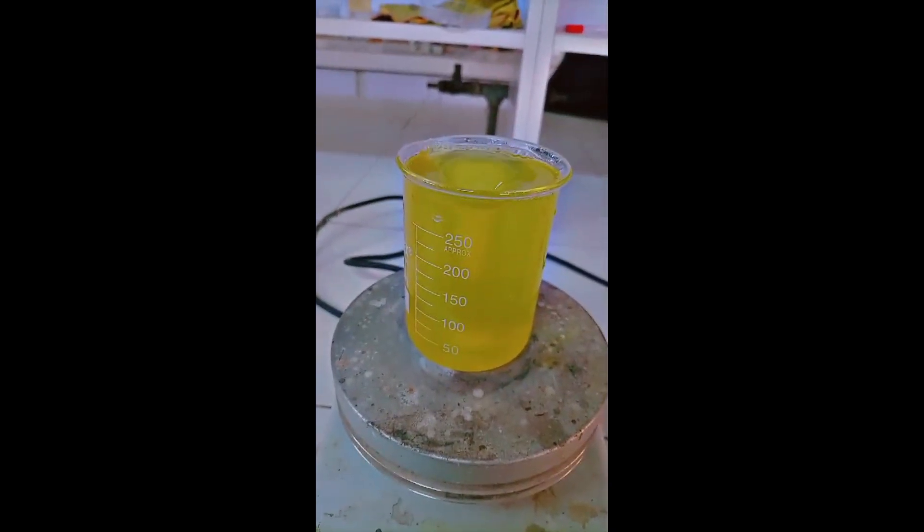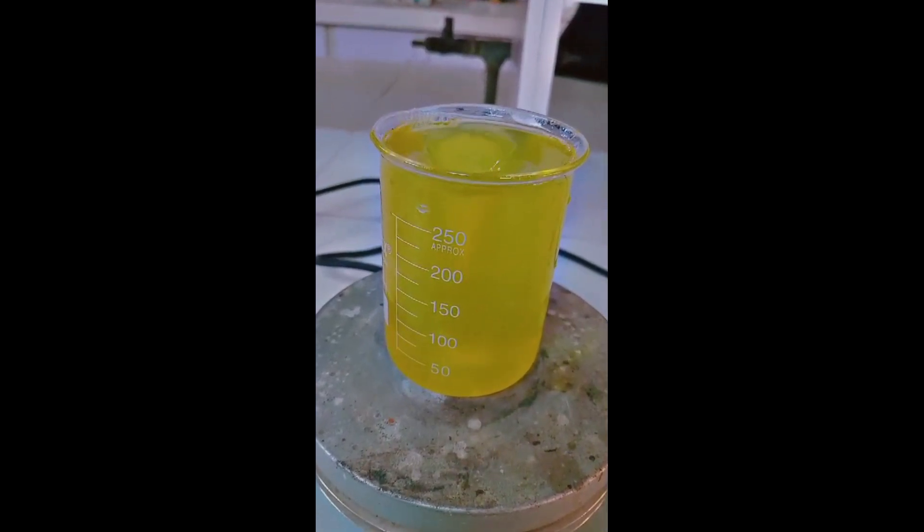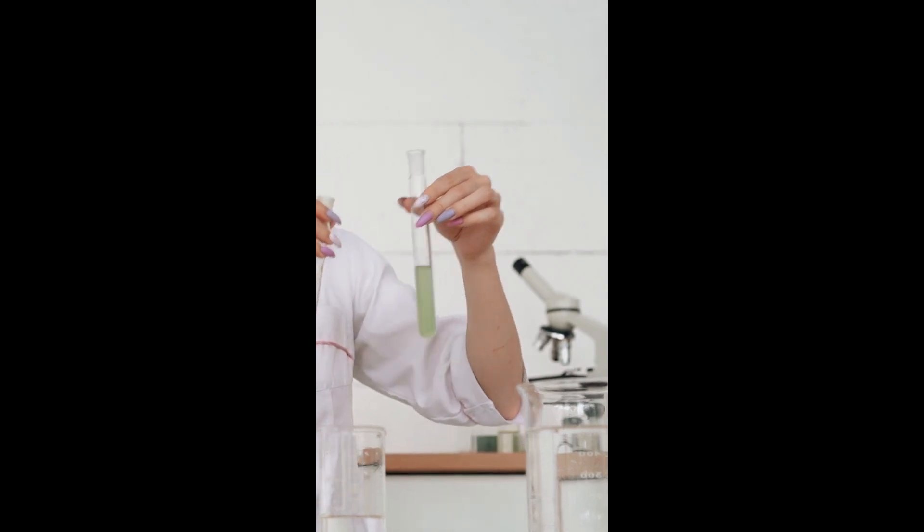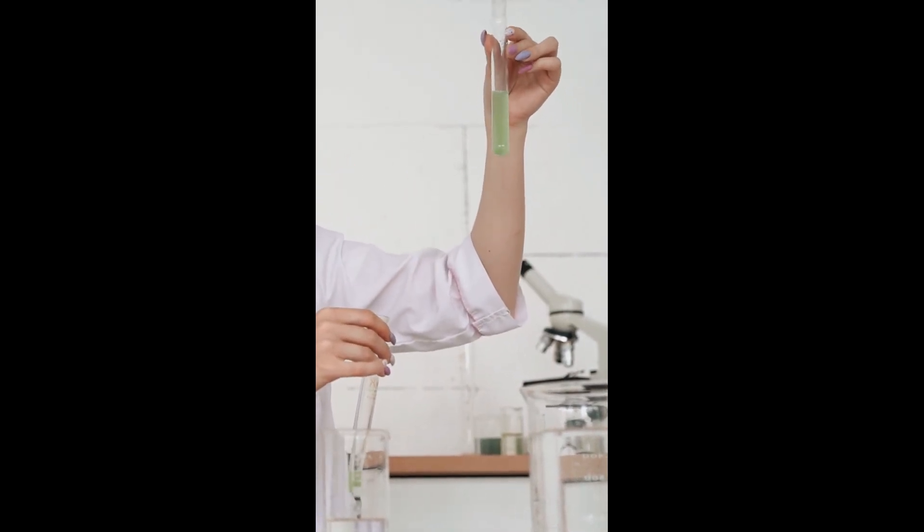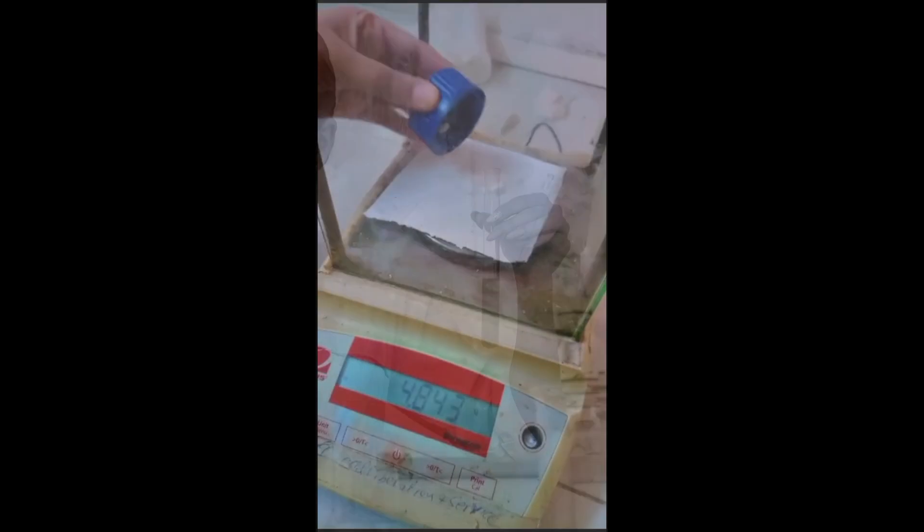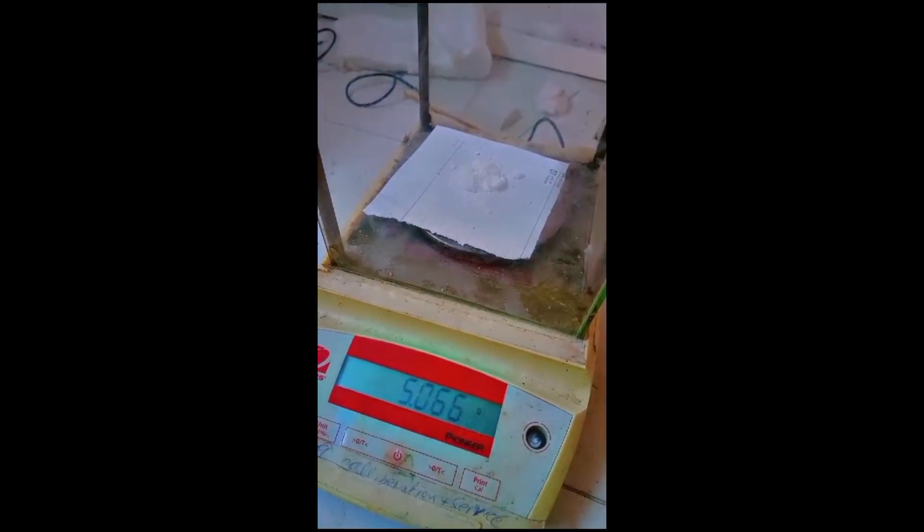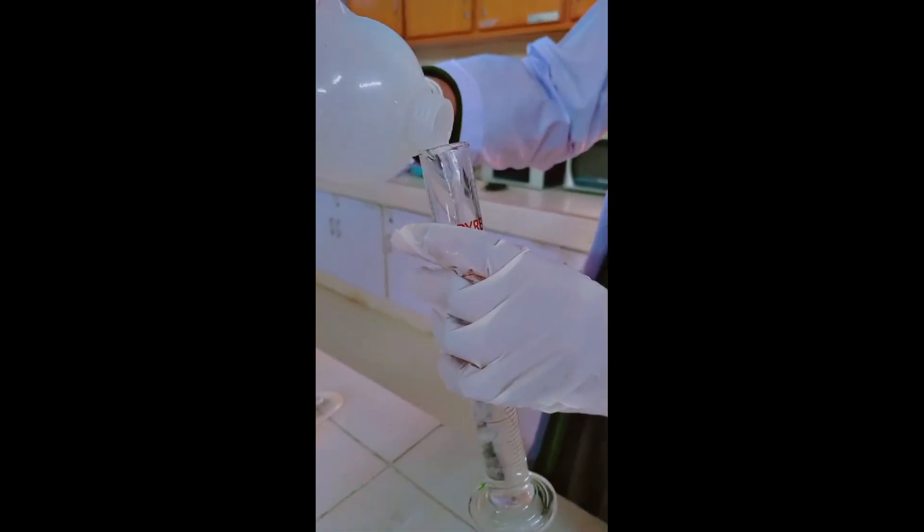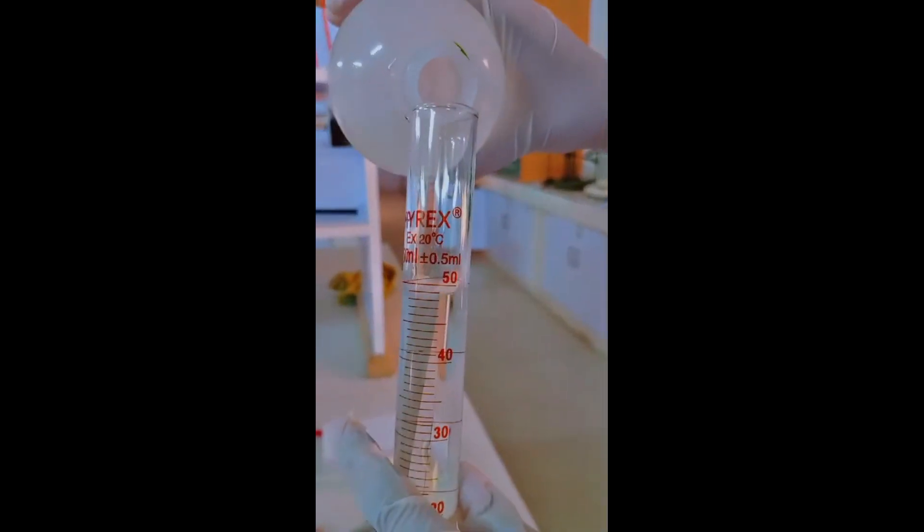In the next step, we will prepare the zinc nitrate solution that acts as the main source of zinc. Take 5 grams of zinc nitrate in a separate 100 ml beaker and add 25 ml of distilled water. Make sure the ratio of zinc nitrate to water is 1:5 (5 grams of zinc nitrate to 25 ml of distilled water). Stir the solution using a glass rod until the zinc nitrate is completely dissolved.